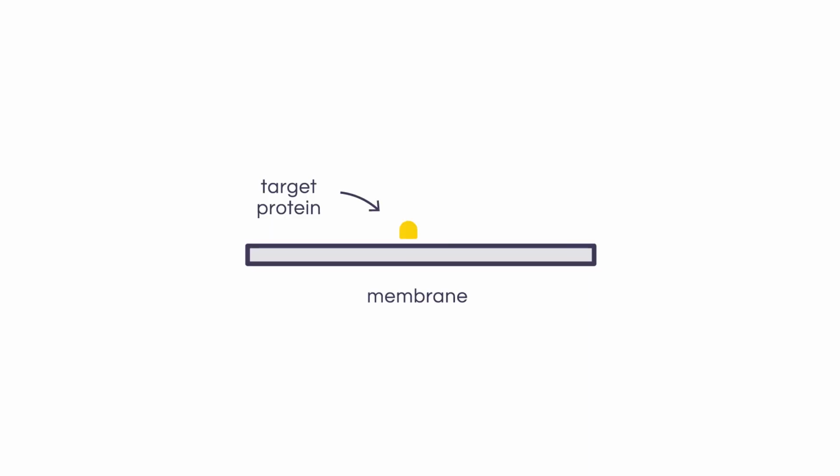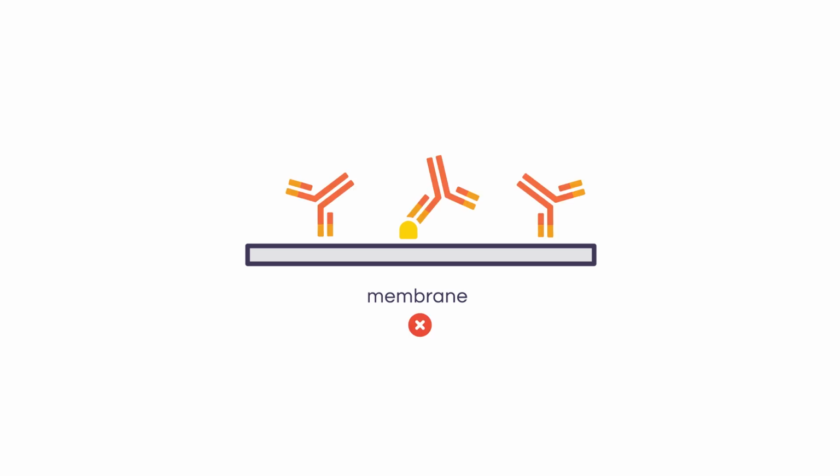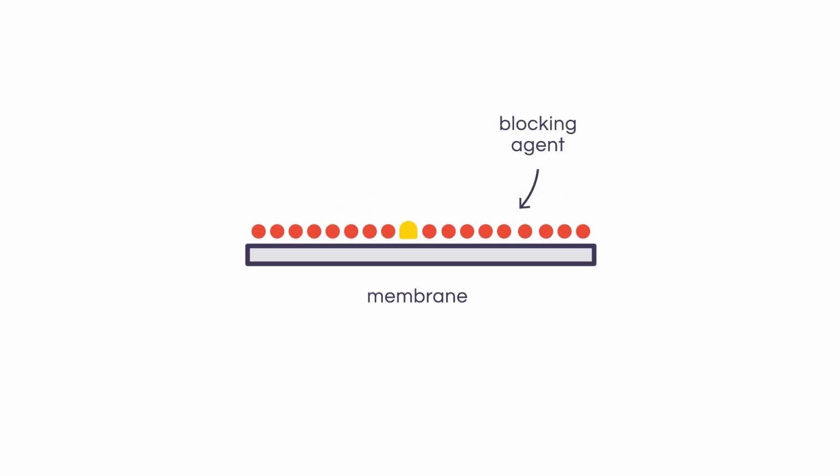Now let's take a look at why blocking is an essential part of the Western blot workflow. When we've transferred proteins over to the membrane, all around those proteins will be empty spaces where there is no protein. Because we've chosen the membrane for its high affinity to bind protein, that means that primary and secondary antibodies would bind nonspecifically to all of those empty spaces. Therefore, the empty spaces must be blocked prior to the addition of the antibodies.